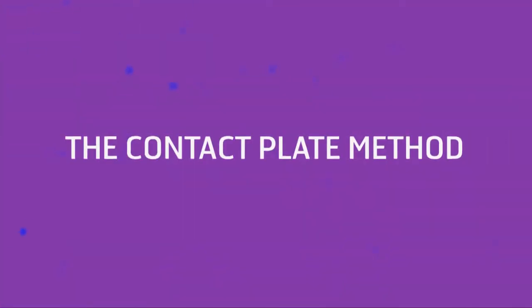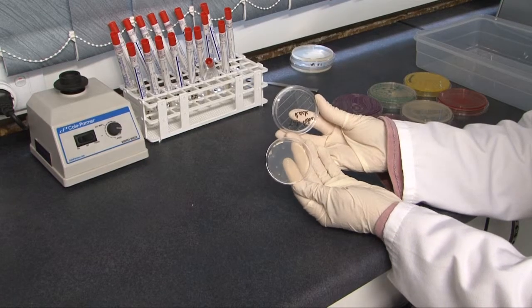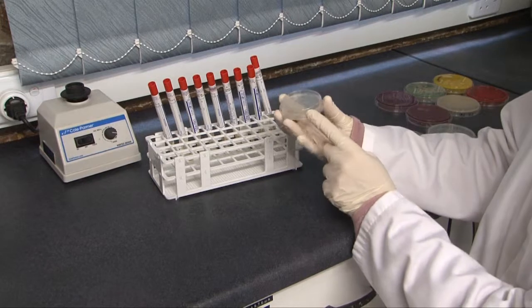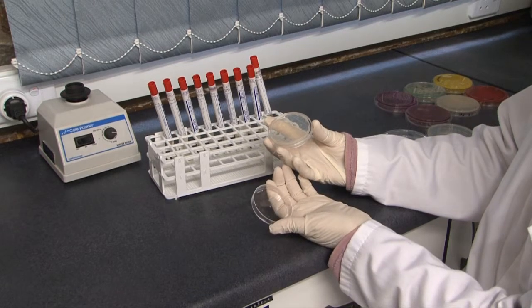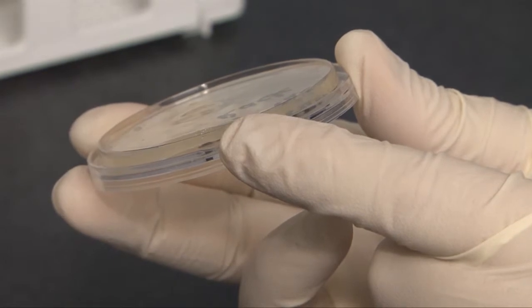The contact plate method. Contact or Rodac plates can be used on areas where it is difficult to swab. It is essential that the contact plates have not been frozen prior to or after sampling. The contact plate must be held by the circumference of the Rodac plate at the base. Remove the lid, ensuring that your fingers do not touch the agar surface.